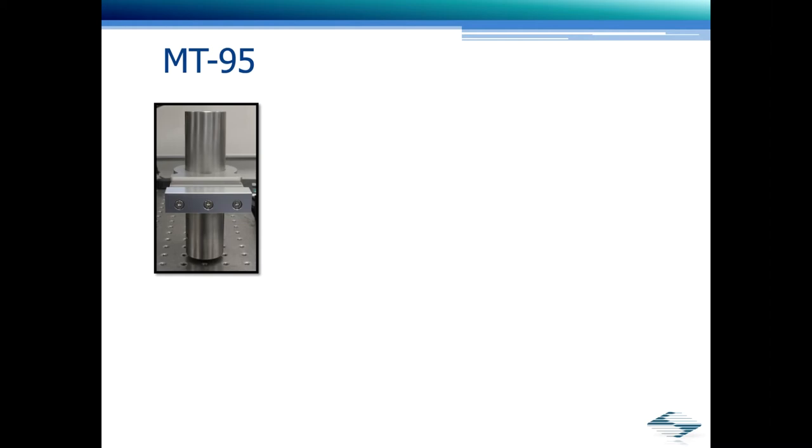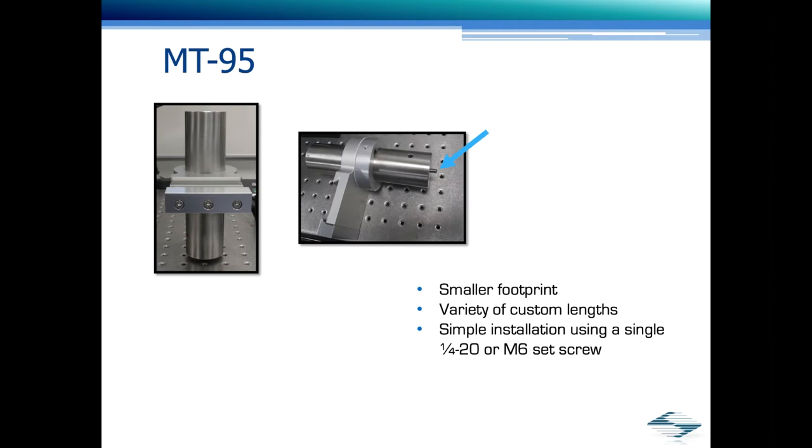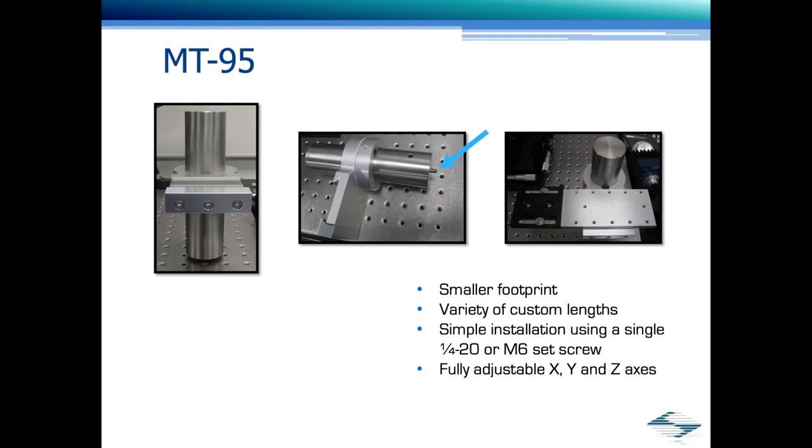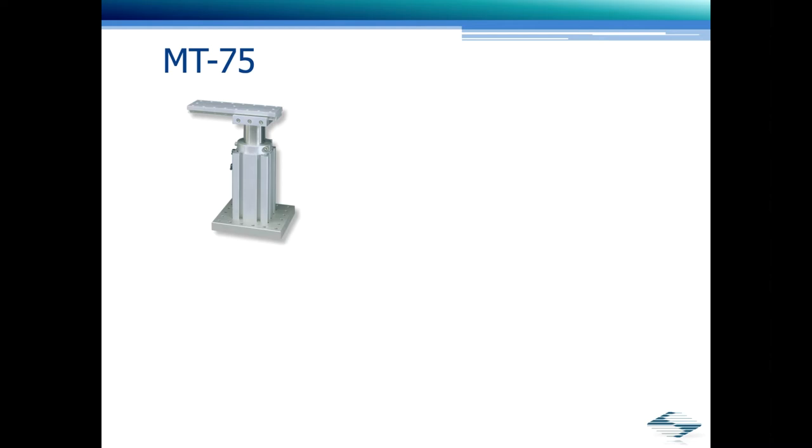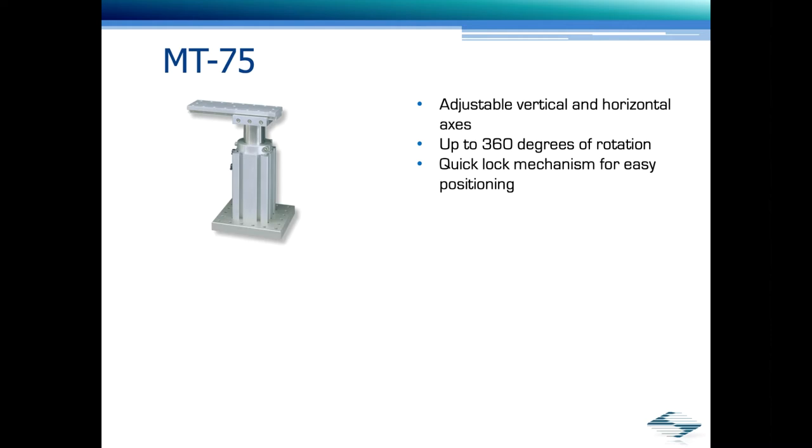In this configuration, we used our newest MT95 stands. As you can see, they are different than our classic stands, but provide the same stable support in a smaller footprint. Variety of custom lengths are available. Simple installation using a single quarter 20 or M6 set screw, which directly mounts into the table. Fully adjustable X, Y, and Z axis. The X axis uses our standard dovetail gantry for greater flexibility. The MT75 was also used in this configuration to hold the chamber column. The MT75 has adjustable vertical and horizontal axes. Up to 360 degrees of rotation. Quick lock mechanism for easy positioning. Solid construction provides stable mounting.